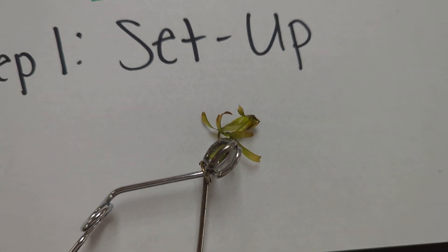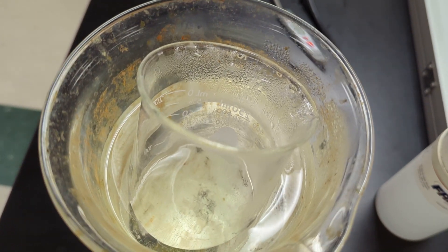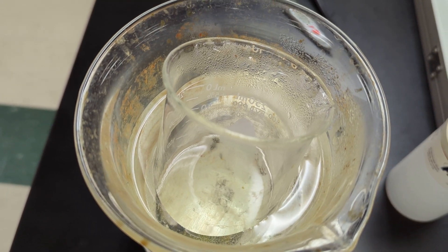First we're going to put it in boiling water for 10 to 15 seconds, and then we'll put it in rubbing alcohol. The smaller container there is the rubbing alcohol. We'll put it in there until it loses its color.